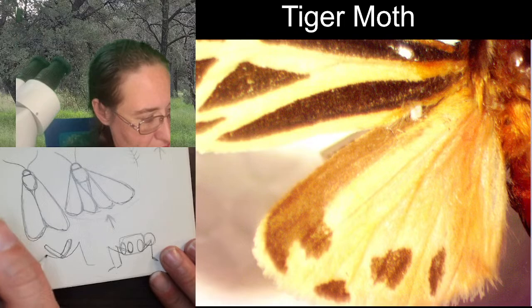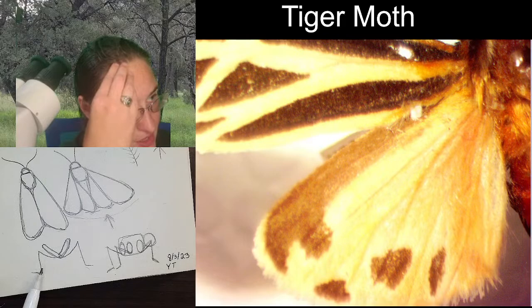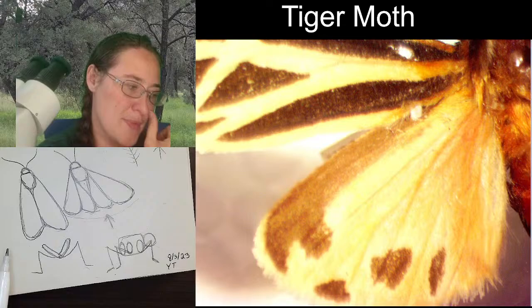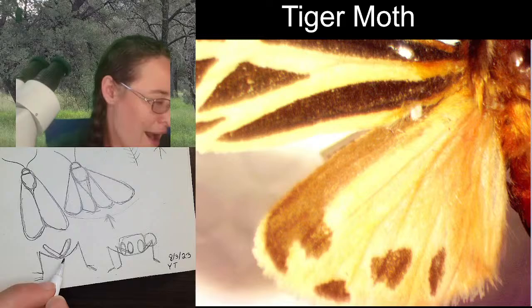Femur, tibia, tarsi. So that also could have been kind of messing with things, because the legs are always connected to the bottom of the coxa, not really the top. That gives better, like, that's for muscle movement. That looks funny.